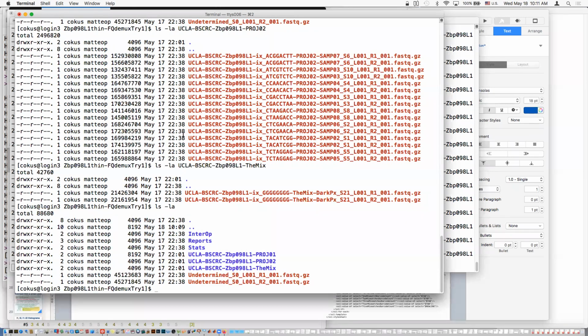And the file names are basically exactly your sample name, then underscore S, and then a number, which is the serial number, just the row number essentially in your sample sheet, with the Demux fail getting a 0. And then we talked about the L001, R1, 001. That's the lane and read number within either the main ends or the index ends. There's no index ends anymore here. So it's just the main ends, main end 1, main end 2, and then part 1 of 1. They're not going to be subdivided into smaller files.